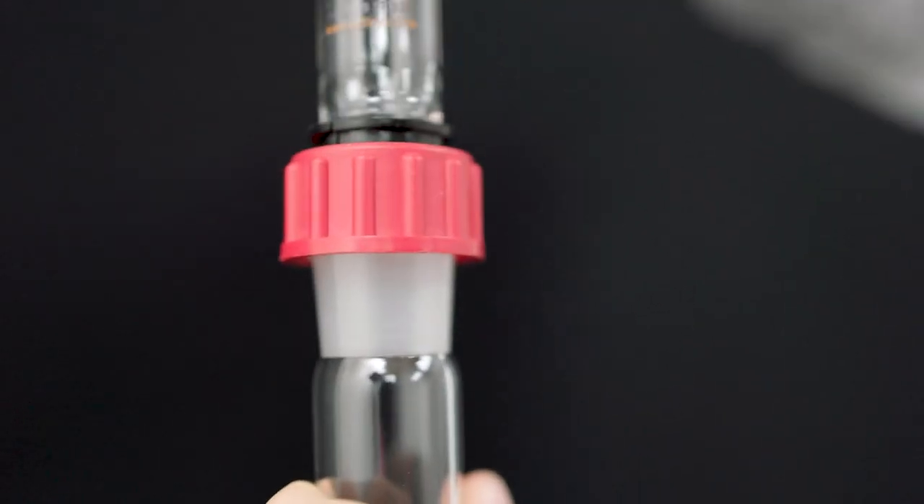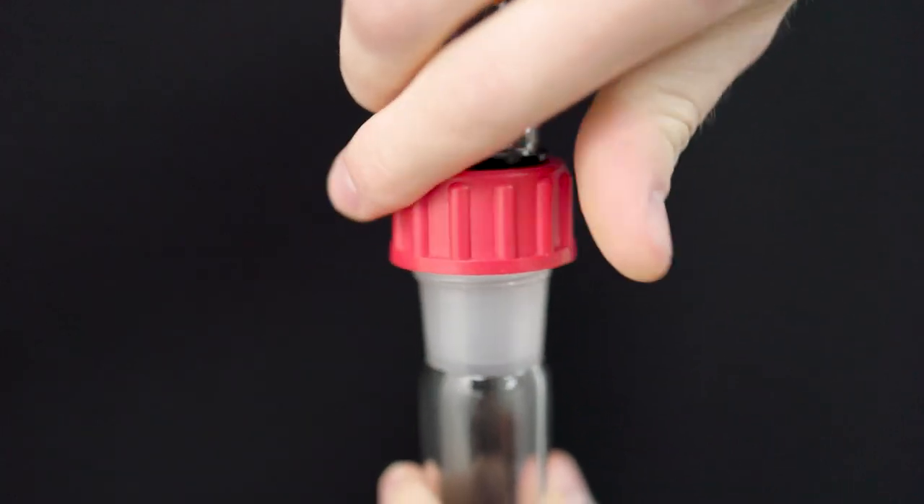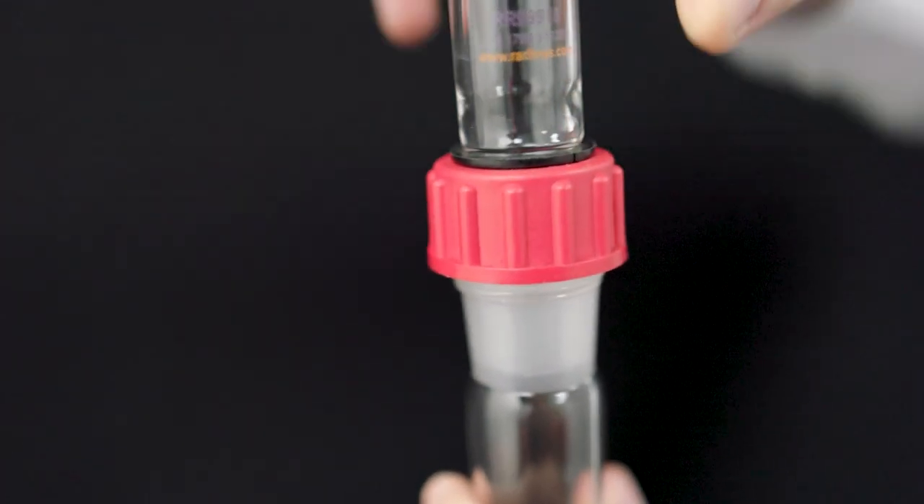What's the significance? As well as being able to secure the cone and socket together, to separate them you simply unscrew the cap back onto the loosening ring, which pushes them apart for safe disassembly.